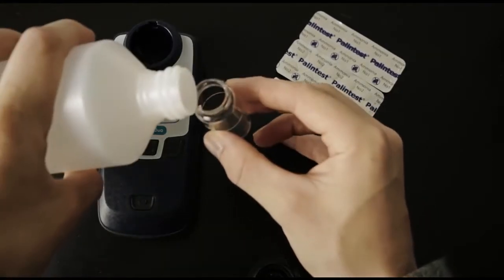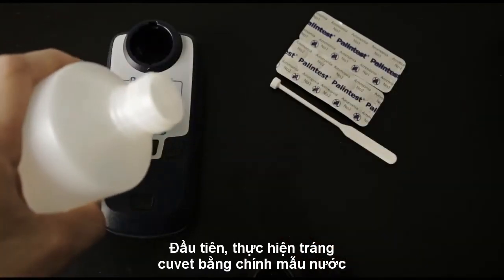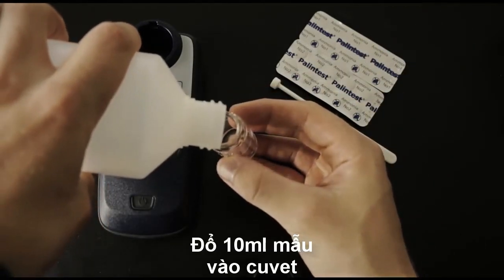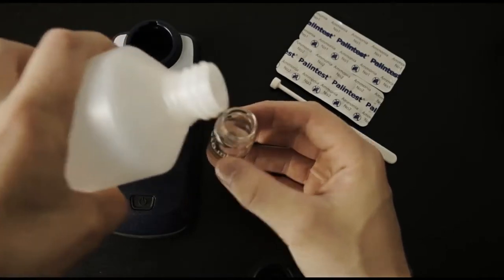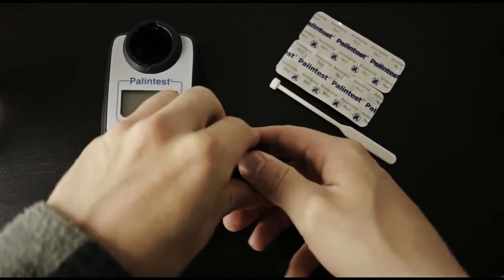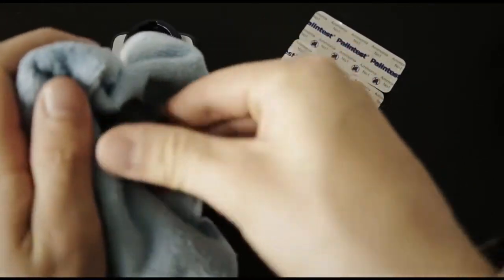First, take a clean cuvette, rinse it, and fill it to the 10ml mark. Cap the cuvette, and then wipe it down with a clean, lint-free, non-abrasive cloth.